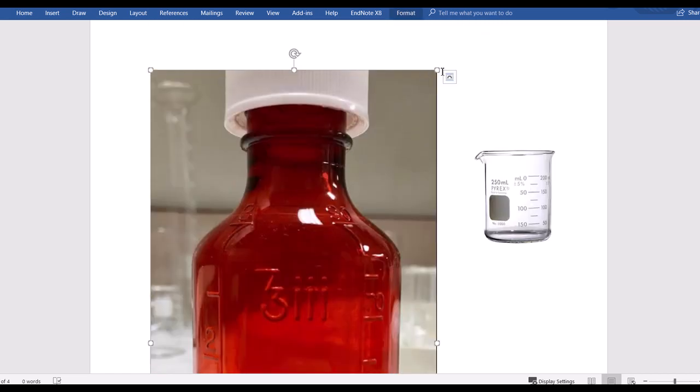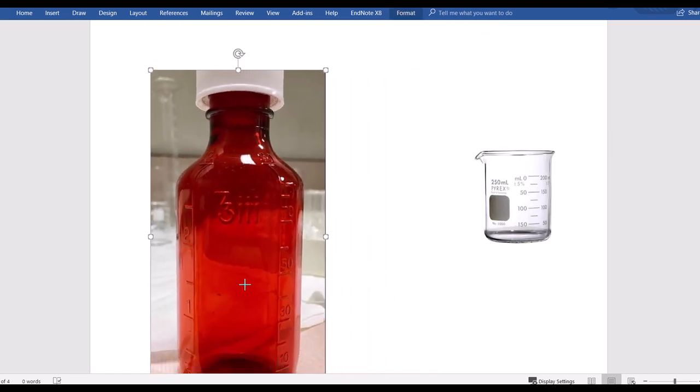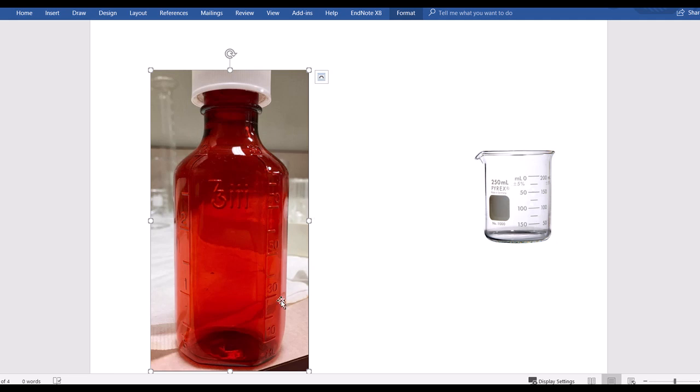This prescription bottle will have units of measurement on the side. This is the ml mark right here. This is the ounces mark here. And you will see our lovely symbol that you know for the amount that it is being used for. So our fluid ounce, and then you see the Roman numerals 3 after it. So it'd be 3 fluid ounces, which is where that top line right here would be. This is how we measure in one of these. It's not all the way up to the top, it's up to this first line that's right there. So these are not accurate, these are estimates.